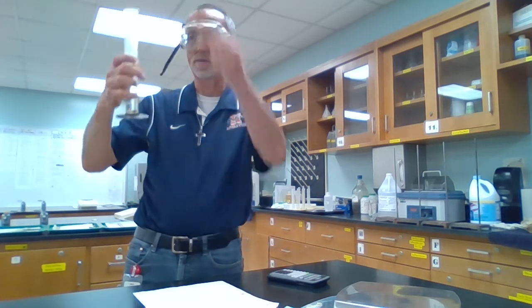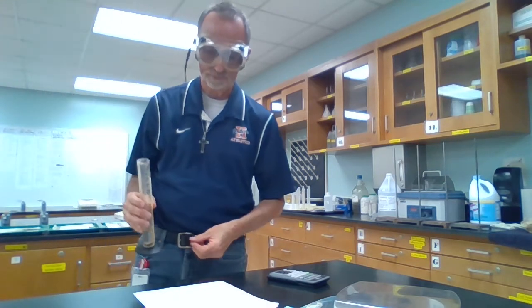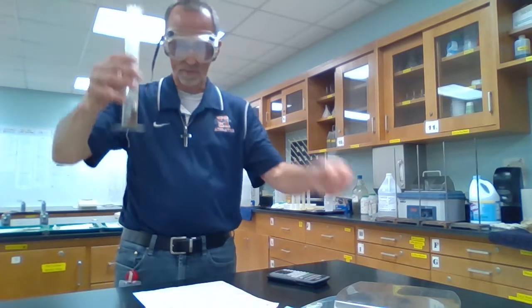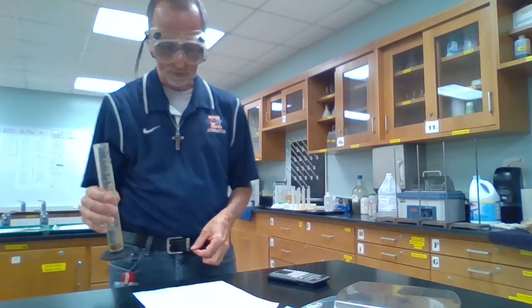Now we're going to 5 pennies. So I'll add 2 more. And now we are up to 2.0 mLs. All right, 2.0. Two more get us to 7. 2.5, halfway in between those two. So 2.5 mLs. Two more get us to 9. Volume of 9 pennies. Once again, we're right at 3.0 mLs. Geez, so far so good.